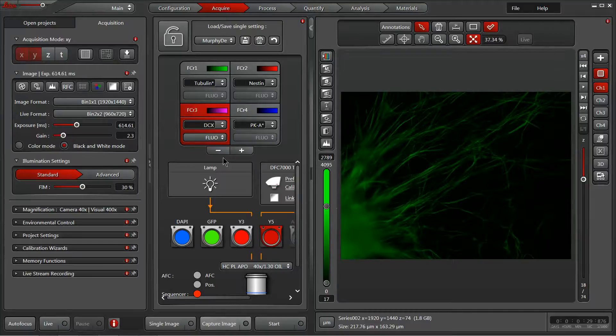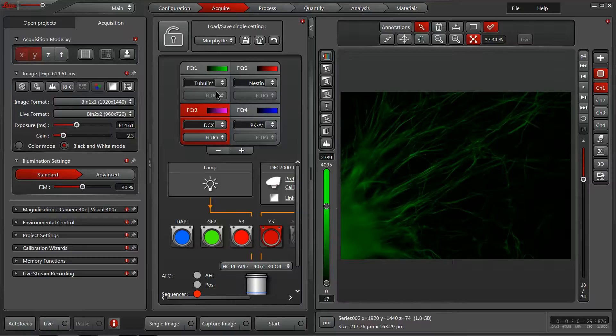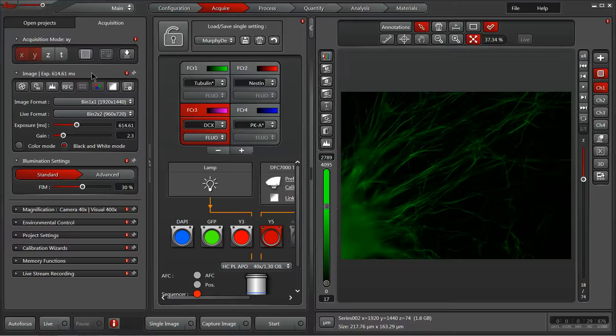Capture image will capture all of the channels but again it will ignore the additional dimension information you've got laid out in your experiment parameters.